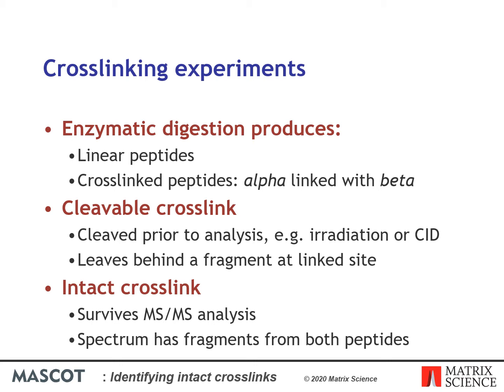The boundary between cleavable and intact is a bit fuzzy. If the cleaving efficiency isn't 100%, there will be some precursors with an intact link. Similarly, an intact linker can fail to form a link, which leaves behind a linker fragment.